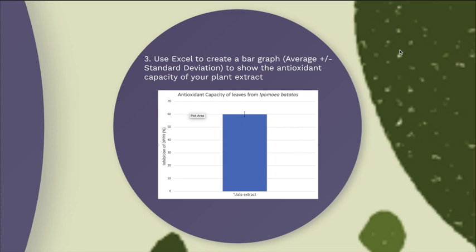As a way of comparison, a brief Google search will reveal that a far less concentrated extract of blueberries is able to neutralize over 95% of DPPH free radicals.